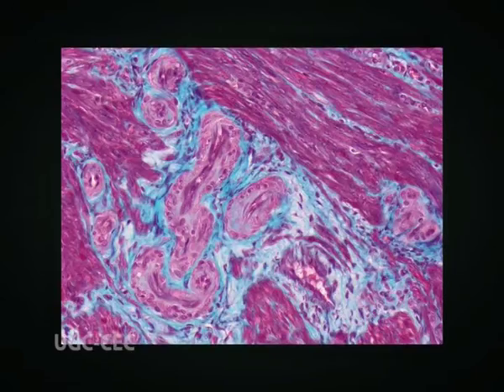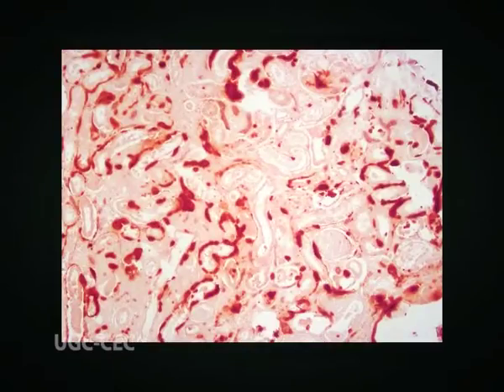To determine collagen, the main component of connective tissue, staining with green or blue trichrome or by means of picrosirius red is quite suitable. Similarly, alizarin red can be used for detecting the presence of bone fragments, and Sudan III, oil red or Sudan black to highlight the presence and structure of adipose tissues. Using these staining procedures, it is possible to analyze not only the dispersion of fat in the product but also its formation in the sub-packing layers.